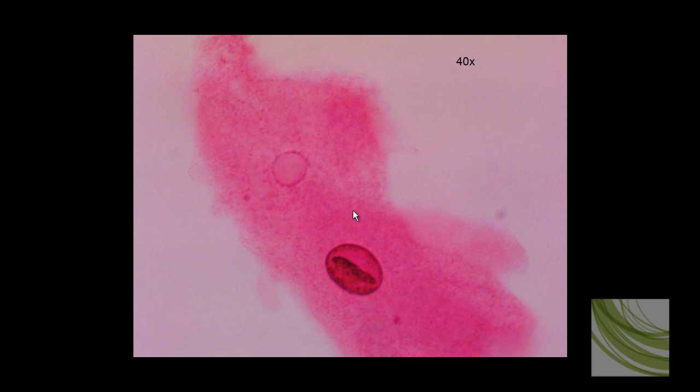If we look at the solution inside the cell, we see that it's got a lot of solute and not nearly as much solvent as outside the cell. This comparison would make this the hypertonic solution inside the cell compared to the hypotonic solution outside the cell, with the result that water would tend to flow into the cell.